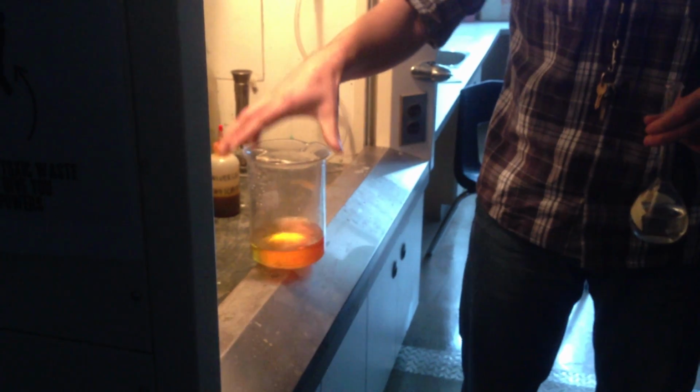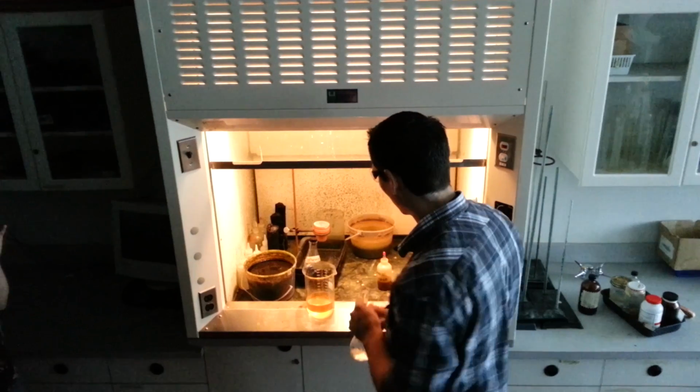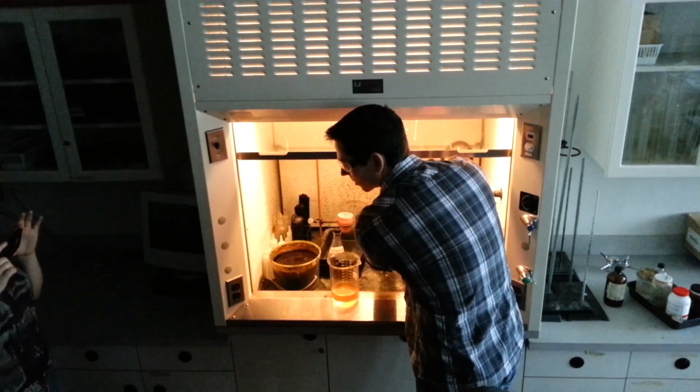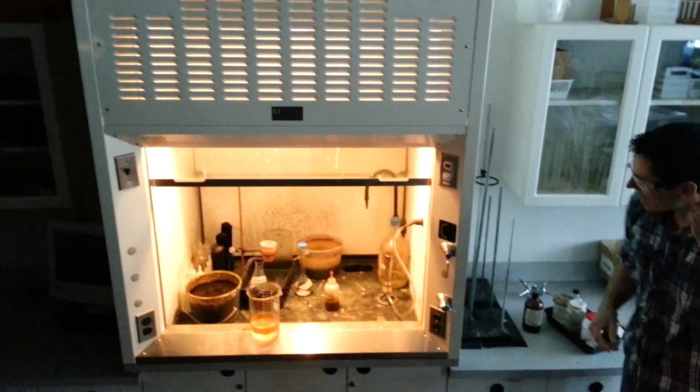Okay. So I'm starting with something that is slightly on the acidic side, which is that yellowish color. And then if it were to go basic, it's going to go towards greens and blues. So we'll see that happening as the reaction goes on.